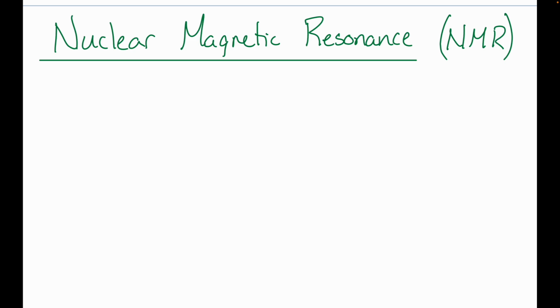All right, so we're going to break this lecture into two parts. One is the background, a brief intro into how NMR works. And then the other half, the bigger half, is going to be practically speaking, how do we analyze NMR spectra? All right, so first of all, let's just say NMR theory.